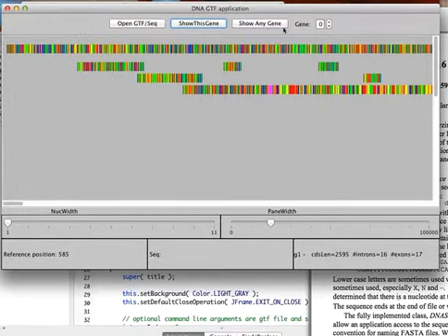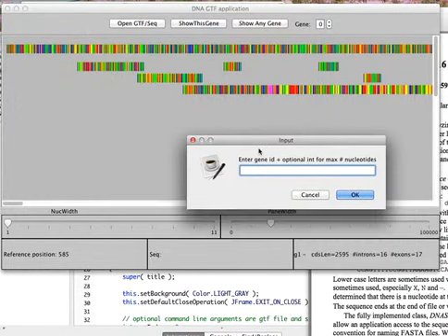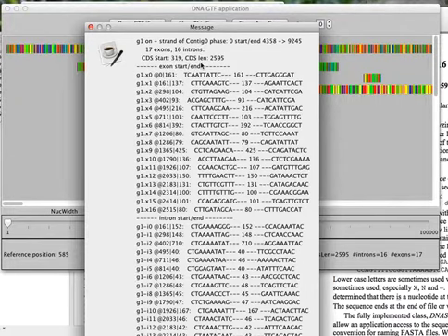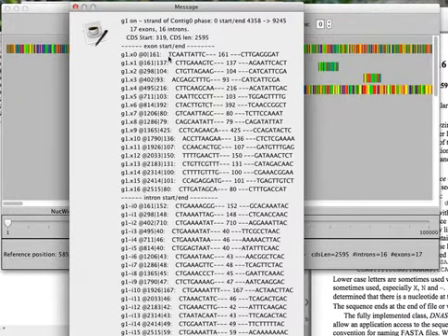We can get the same information. We'll show any gene, but that requires that we type in the gene ID. And you can give, oops, not G9, but G1, and you can give a number which says how many of the leading and trailing nucleotides you want printed. So in this case, we'll do 10 instead of the default 4. And now we get the same information, except that the program takes the first 10 nucleotides in the sequence and the last 10 just as a check if you wanted to check.